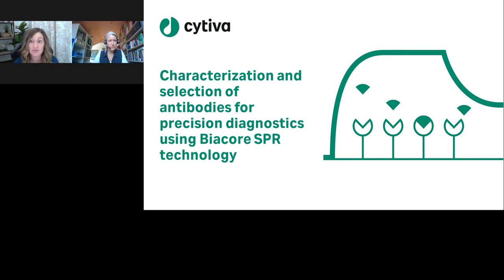Which sample volumes do you need for an analysis? Oh, yeah, this is a good question, and maybe also in comparison to other assays, very interesting. As an example, for the analysis I showed in the Biacore T200, for such a concentration measurement, you will need 40 to 80 microliters of your sample for a 1 to 5 minute injection. And it doesn't matter if you investigate just this one analysis or directly investigate 4 different interactions, as the sample passes over all surfaces as the identical solution, giving you 1 or up to 4 different interaction results.